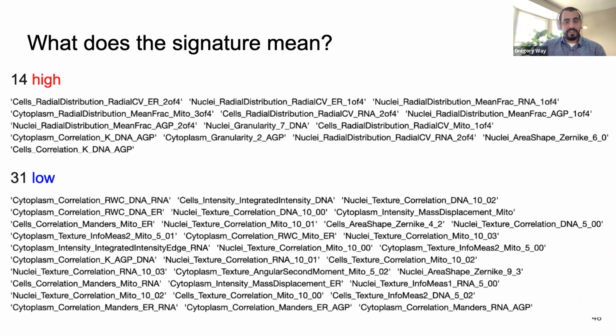It works to some extent, and many of these individual Cell Painting features are correlated to some genes, but it's not perfect performance. There's some level of signal loss when you try to go from one to the other, which is expected.